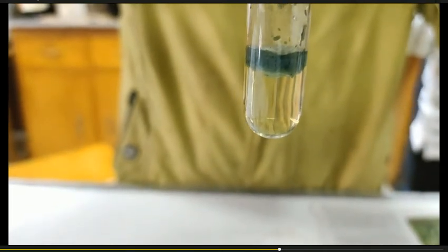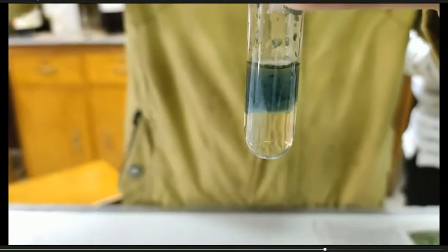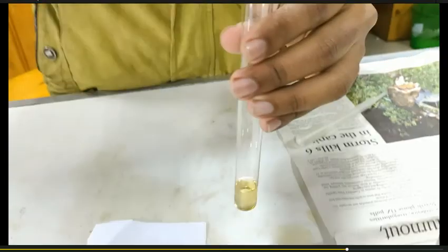the PPT will also be insoluble in excess amount of ammonium hydroxide. He is adding excess ammonium hydroxide, and the PPT is insoluble. As the amount of ammonium hydroxide increases, the PPT also increases. So this is indicative of the presence of ferrous ion. This is another famous test for the detection of ferrous ion.